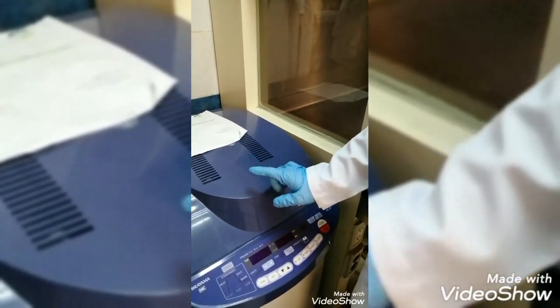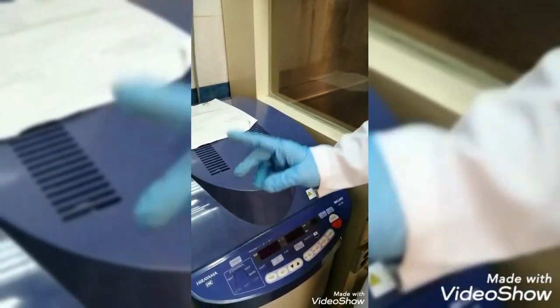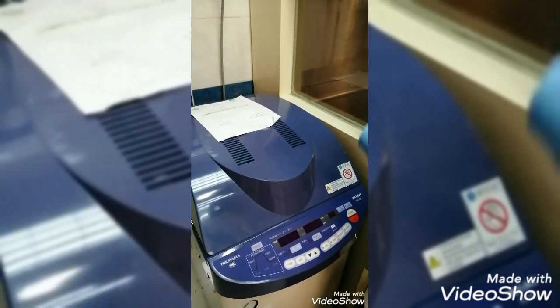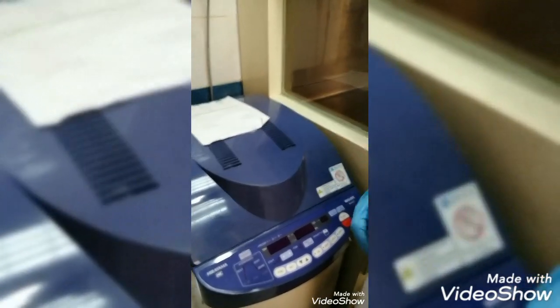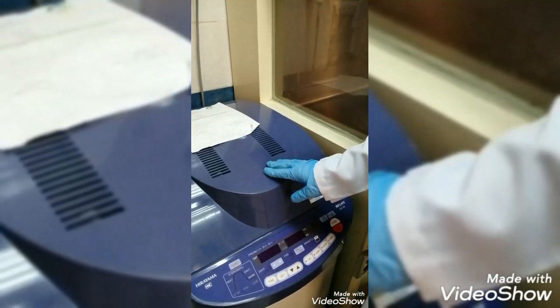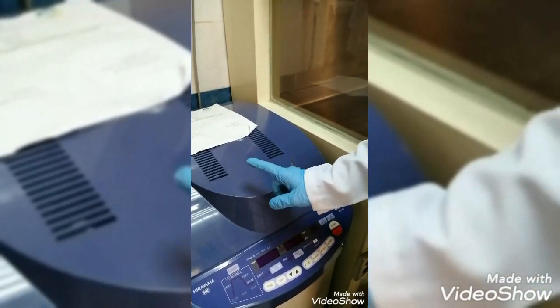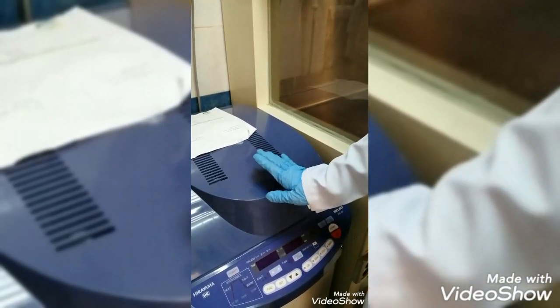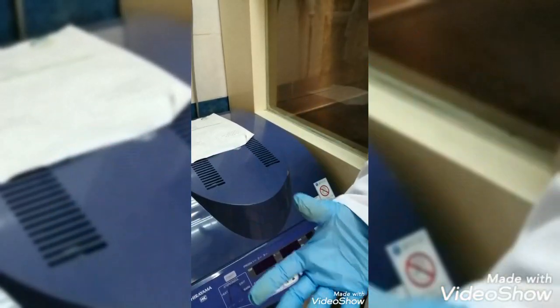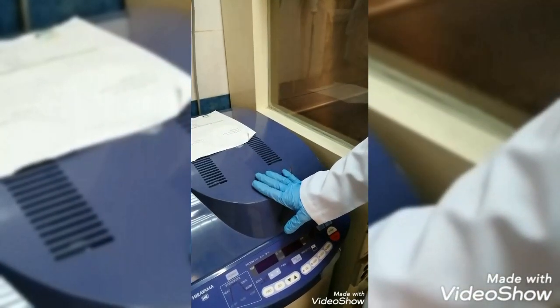An example of moist heat is the autoclave. This device provides a method of sterilization by steam and pressure. So we apply pressure with steam to kill microorganisms, especially their spores. It has a temperature of up to 121 degrees and a pressure of up to 15 pounds per square inch, for about 15 minutes. With it we can sterilize surgical instruments, bacteriological instruments like loops, culture media, or even some dental instruments. And this is the best method for killing spores.